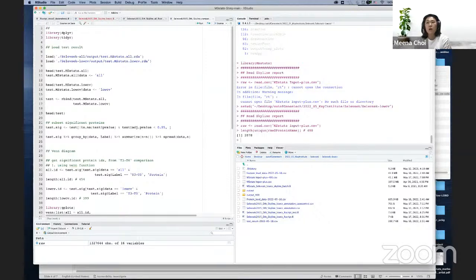Sometimes if our assumption for a normalization is not suitable for your case, you can completely ruin the data. One example is the IP experiment. Global protein profiling means we just quantify all the proteins in the samples. But the IP case is quite different, right? We have a bead and we grab whatever interacts. First of all, the total quant of the protein is different, and their levels are also really different. But the normalizations we are proposing, especially equalize medians and quantile normalization, have an assumption: with a large number of samples, the majority of intensities should be equal. The majority should not change across the samples. Based on this assumption, we can do it.